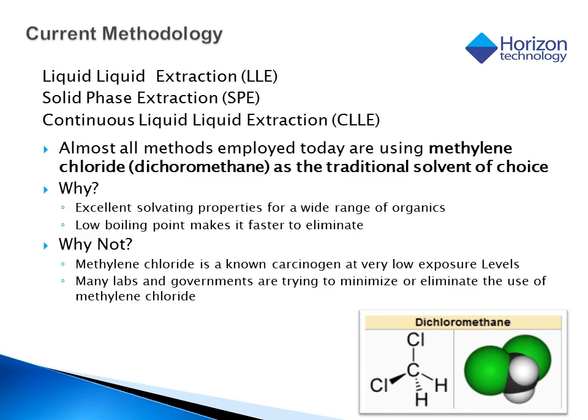In all of the existing methodologies, methylene chloride is the solvent of choice because of its excellent solvating properties across the entire polarity range of compounds, and also because of its relatively low boiling point, making it easier to concentrate extracts faster. It is for this reason historically that DCM has become the universal solvent used in labs everywhere.